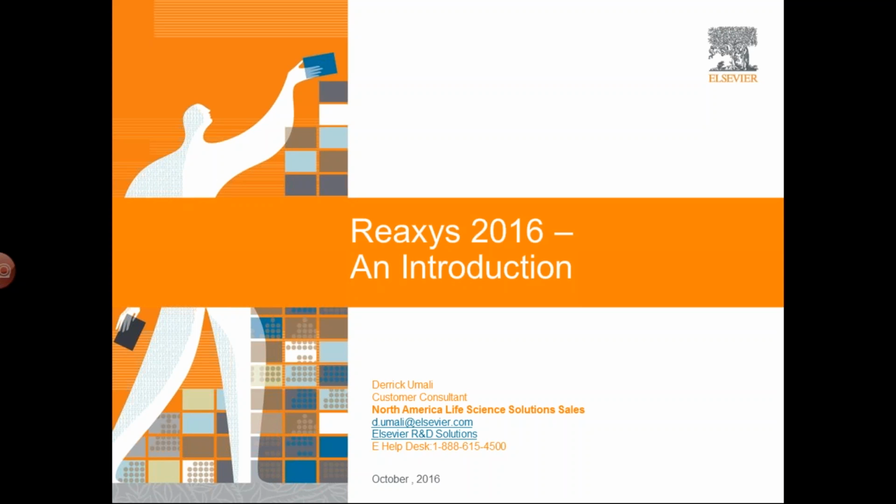So I'm very familiar with what a customer has to go through when you're switching from one application to the next. So if there are questions around that, I know some folks are probably using the old Reaxys and have questions on what support materials we have out there for customers migrating to this new Reaxys, and what some recommendations are.